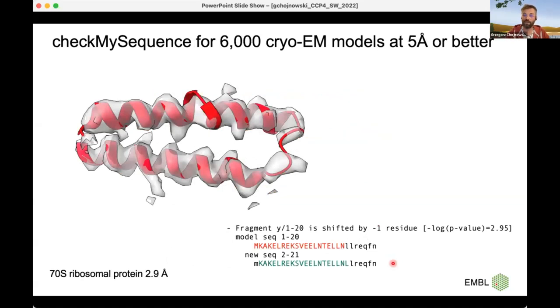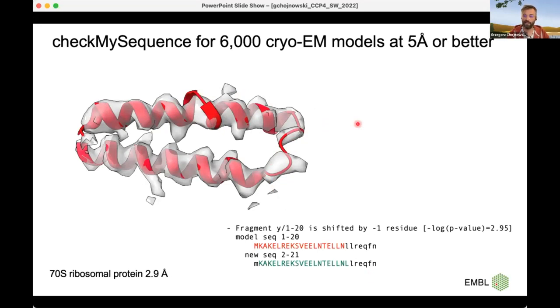I ran it on a larger dataset: approximately 6,000 cryo-EM models at five Angstroms or better — 7,000 in total, but excluding very large maps for pure technical reasons, which are mostly viruses anyway. The average runtime for this dataset is roughly one and a half minutes, meaning it took over 100 CPU hours to calculate — that can be done in a day on a modern laptop. I will now show a few of the most prominent issues found, tweaked in presentation to make it clear where the error is.